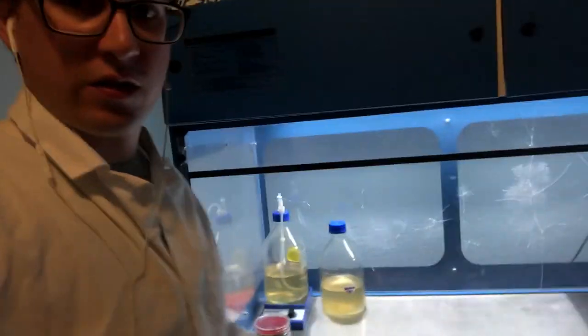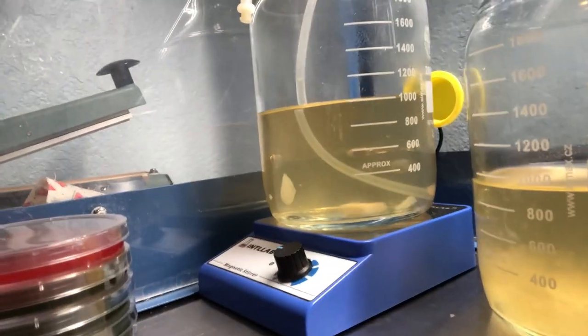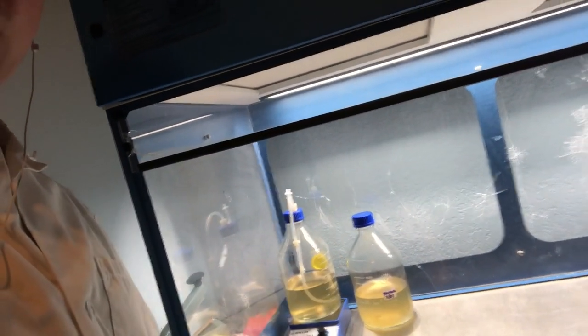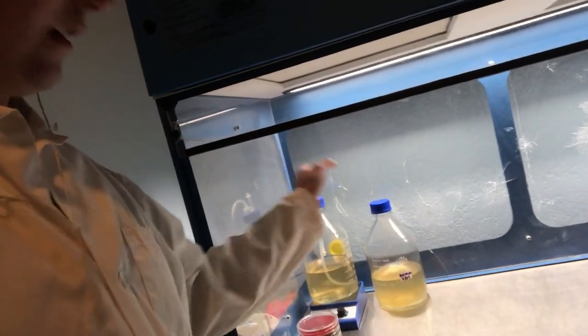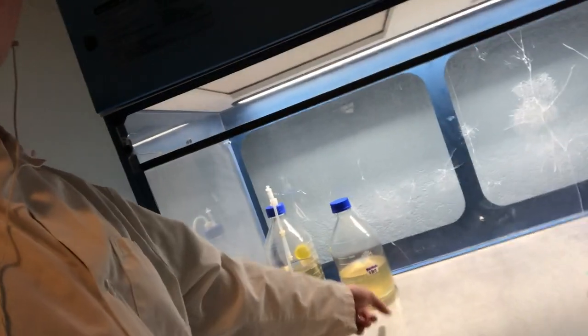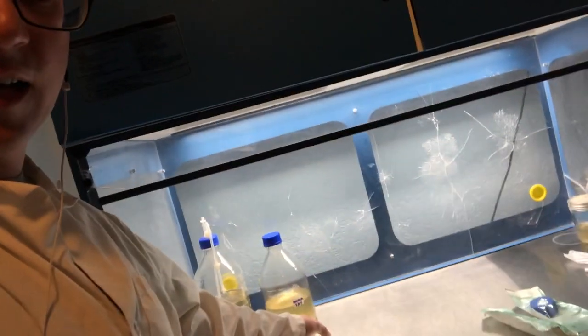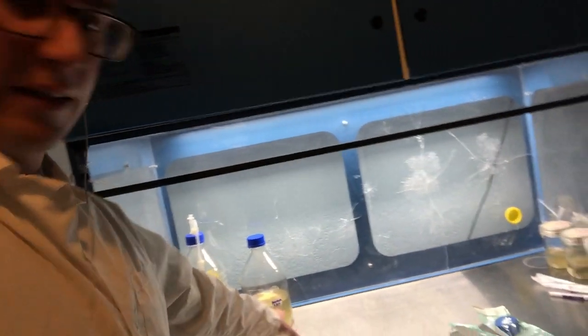What's up guys? So it's been about 2 days now, and that cordyceps culture has got some growth. So I'm gonna go ahead and QC that today. And then since this Morchella is definitely starting to thicken up, I'm gonna make some sawdust spawn and put some of this Morchella in, and I'll show you guys the whole capabilities of this media extractor. So first I'll do my QC. And then I'm going to re-sterilize this one more time before I use it to inoculate a bunch of grain spawn or sawdust spawn, and I'll do some grain spawn too, just to test that out outside. But this is morel liquid culture that is almost ready.